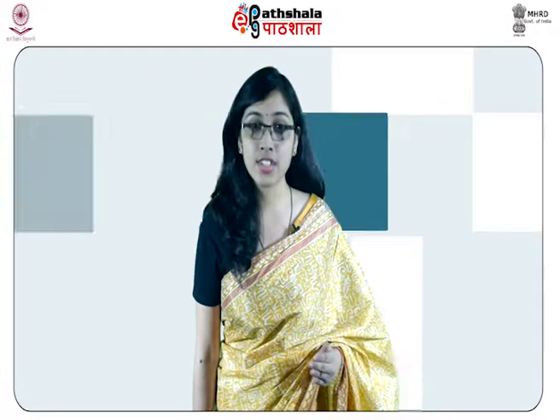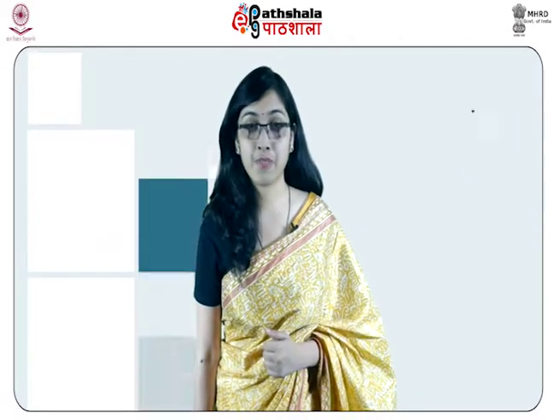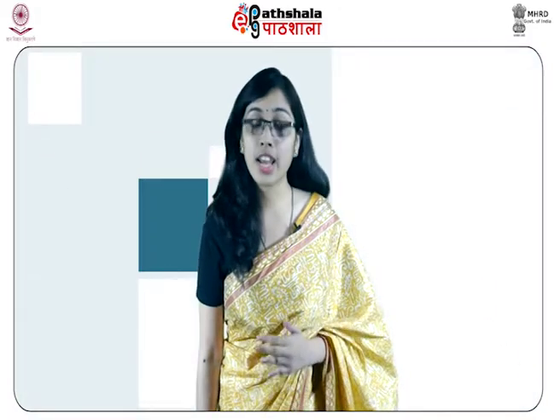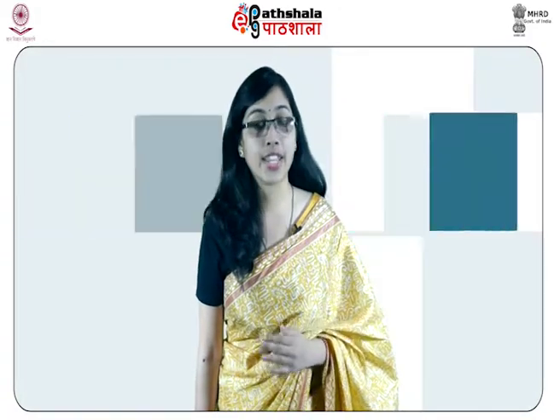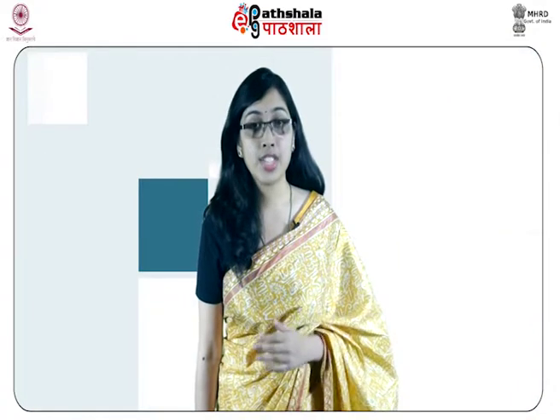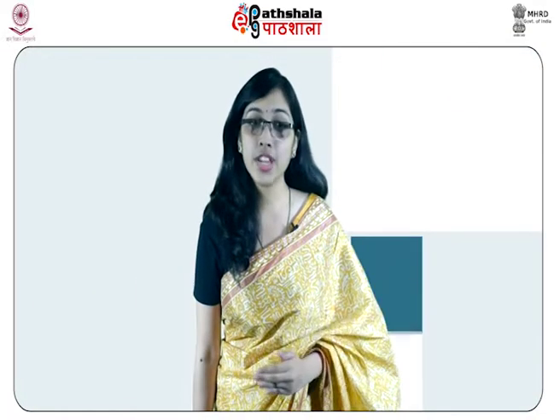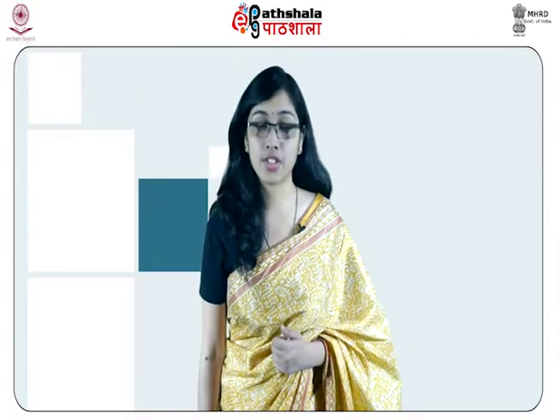These evidences are mainly used for DNA investigation. Before collection, these evidences are photographed at the crime scene and then sent to laboratory after collection. DNA specific to each individual serves as an effective means of identification.